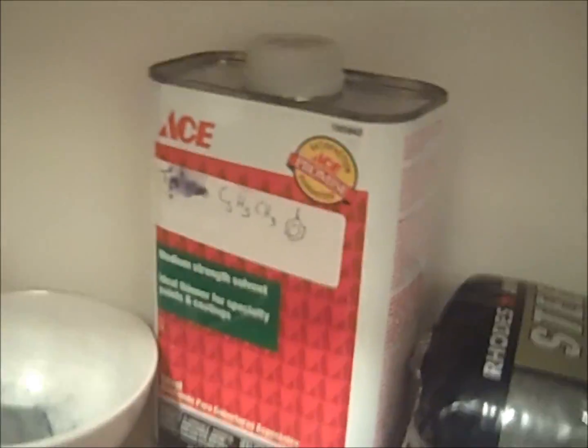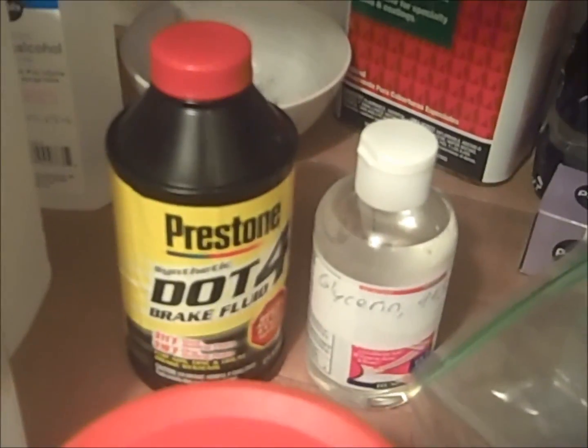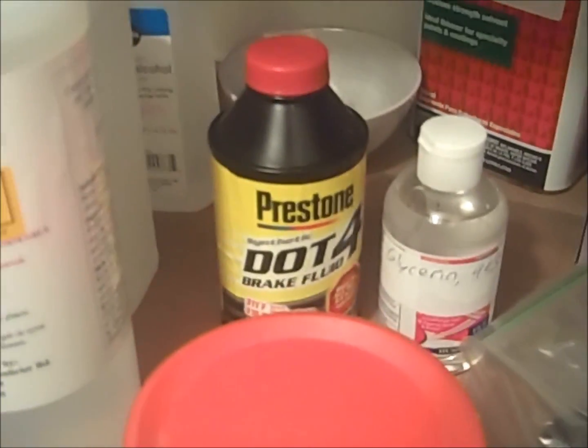This is toluene, which is sold in the paint section of hardware stores for various uses. This is glycerin. It can be sold at Walmart and other similar places, and it is generally used as a hand protectant for cold weather and whatnot. This is brake fluid, sold in the automotive section of Walmart as well as other places. I prefer the DOT 4 because, for my experiment, it has a higher boiling point.